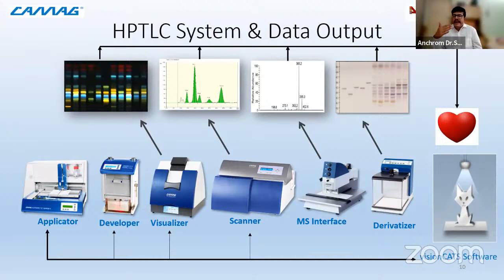So the plate has an indicator in it. There is a UV active compound which is added to this plate surface. So it fluoresces when exposed to the 254 nanometers wavelength, and the quenching that is there, that is being absorbed, that is the actual band. And with these 2 techniques, and even the white light, where you see the bands visibly, that is also being documented with the visualizer.